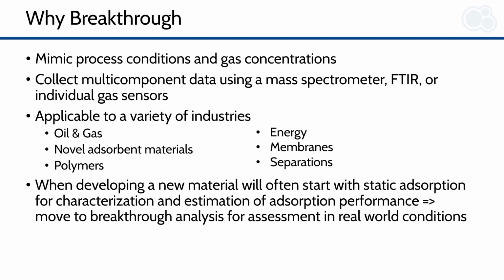So the next question you might ask is, okay, why do I care about breakthrough? Well, breakthrough is a powerful technique because it allows you to mimic process conditions and gas conditions that you may find in industrial processes. You can also collect multi-component data using a mass spectrometer, FTIR, or individual gas sensors.